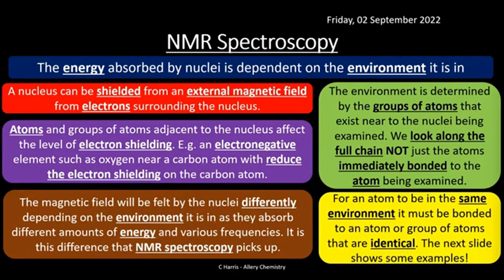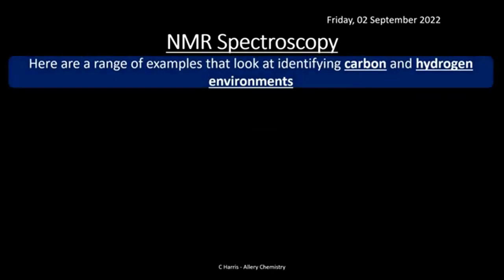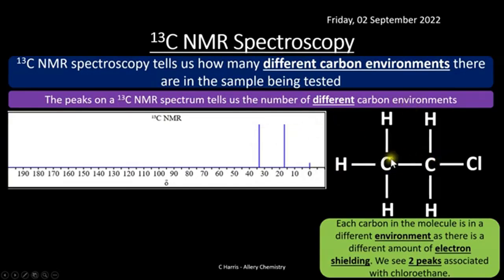Next device is NMR, nuclear magnetic resonance spectroscopy. We have two kinds of analytical machines to identify carbon and proton NMR. Carbon NMR tells us about carbon-13, information on how carbon atoms are arranged, and they have a high resolution. Proton NMR tells us information on how hydrogen atoms are arranged. We are going to look at both of them.